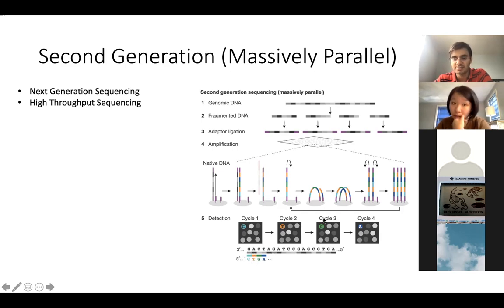The average size of this fragment here for an Illumina machine is less than 1,000 base pairs. So in Sanger, I believe the size of the read that is generated is also less than 1,000 base pairs. The difference in this process is that we are reading 25 millions rather than one sequence. Does that make sense?